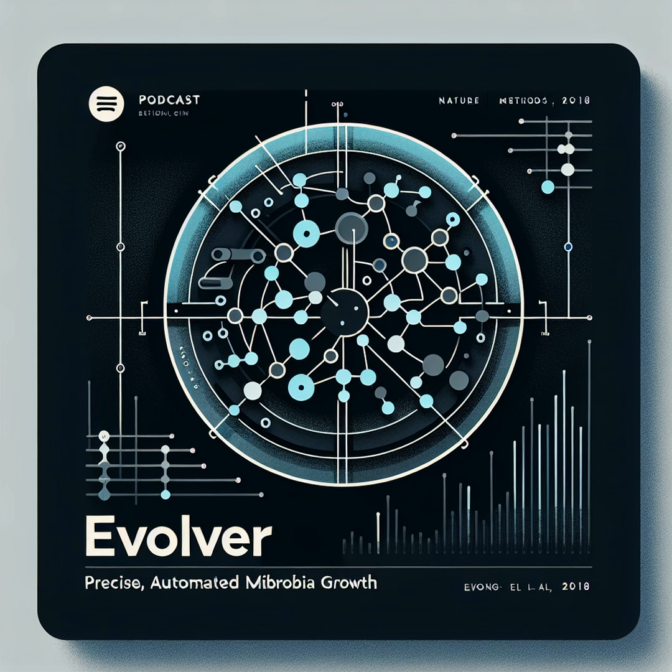So, we've explored the ingenious design of eVOLVER, with its smart sleeves, flexible fluidic control, and sophisticated control system. Now, let's consider the real-world impact. What are some of the key applications of this technology? The applications are incredibly broad, spanning various fields. The ability to conduct high-throughput experiments with precise control is transformative. Think about accelerating drug discovery, materials science, or even synthetic biology.